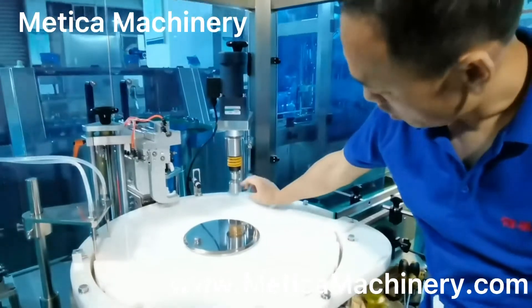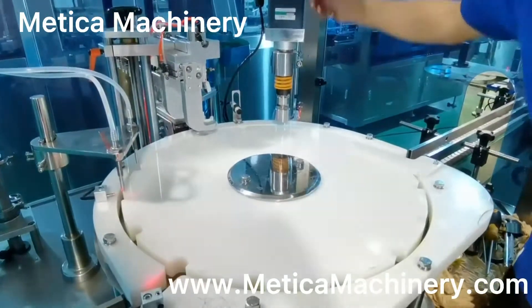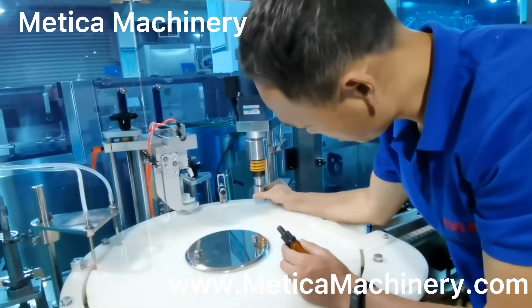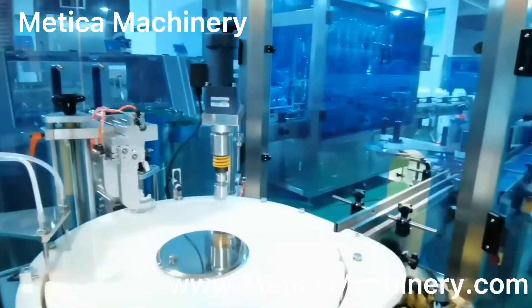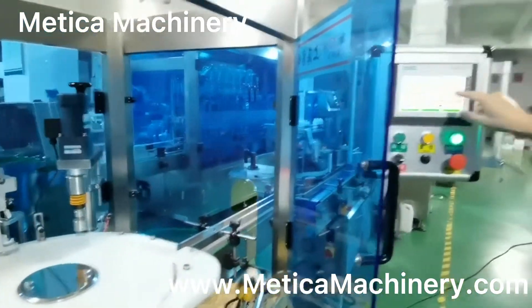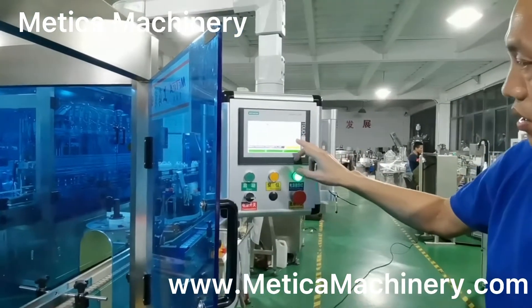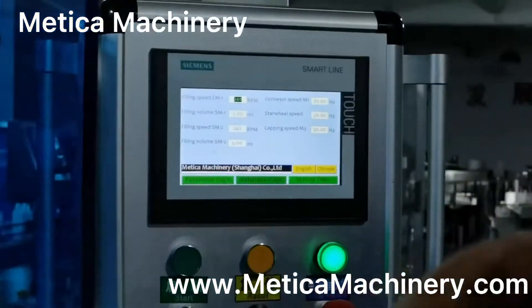If it is a little bit lower, we can unlock this one and lift it up a little bit. Make sure when it touches, it presses only halfway — not too much. For the speed, in the parameter settings, we normally keep it at 45 to 50 to get higher speed and make the cap tighter.